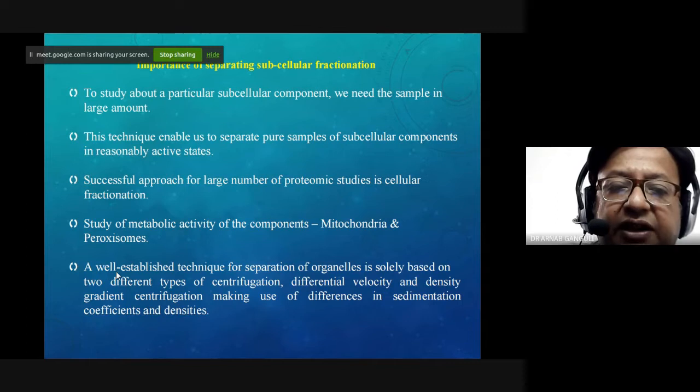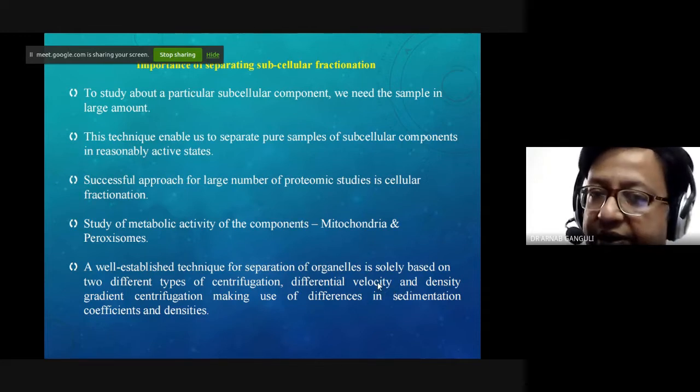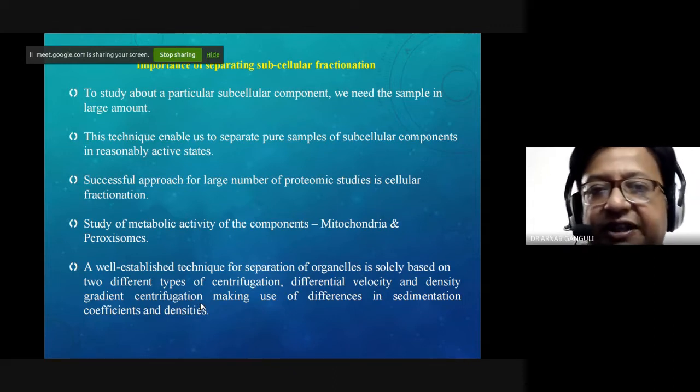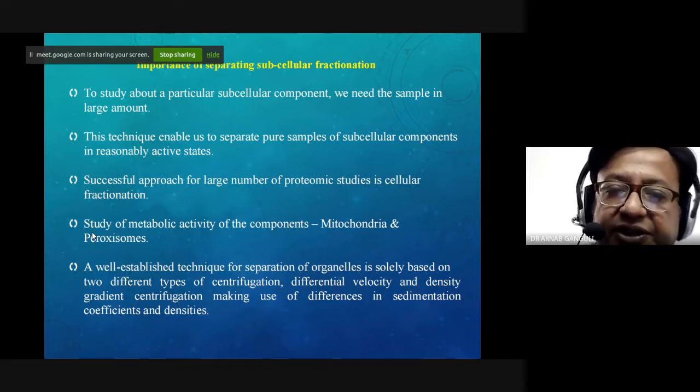And so there are basically two types of techniques for separation of organelles. First is differential velocity, this differential centrifugation, and the other is density gradient centrifugation. In your syllabus you don't have density gradient centrifugation, but you have differential velocity centrifugation.